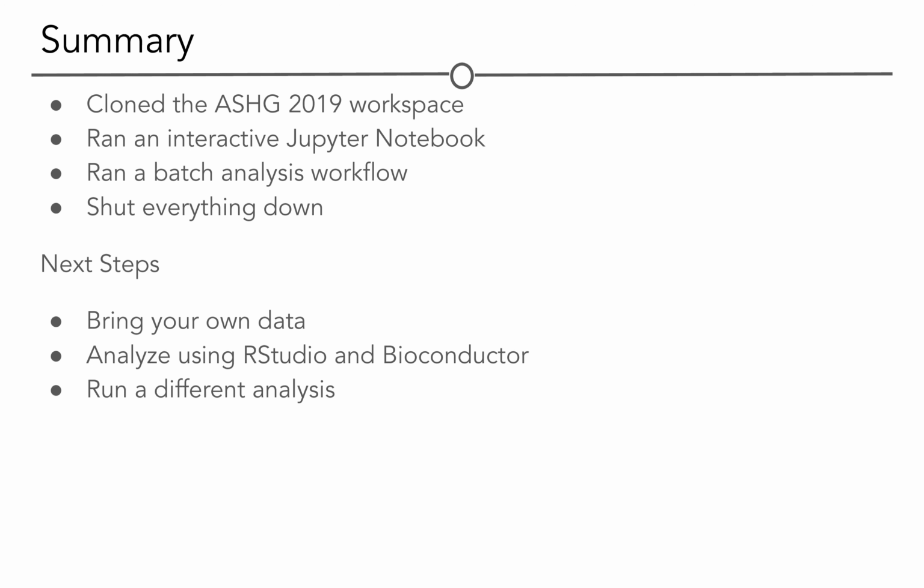In this tutorial, you cloned a workspace, ran a Jupyter notebook, ran a batch analysis, and shut everything down. From here, you can learn how to bring your own data, analyze using RStudio and Bioconductor, or run a different analysis.